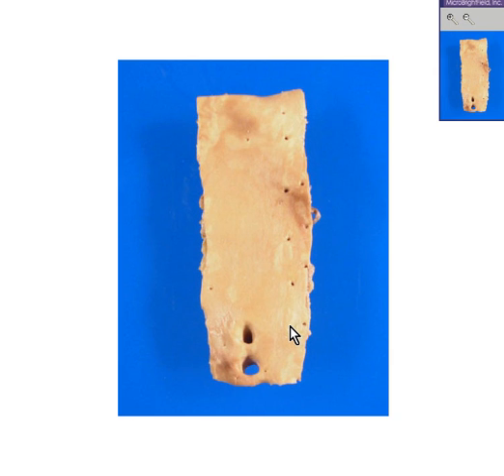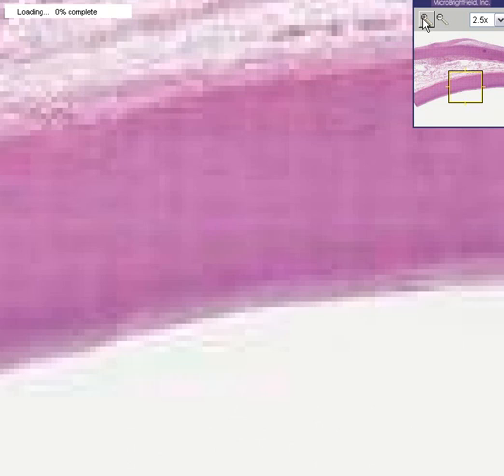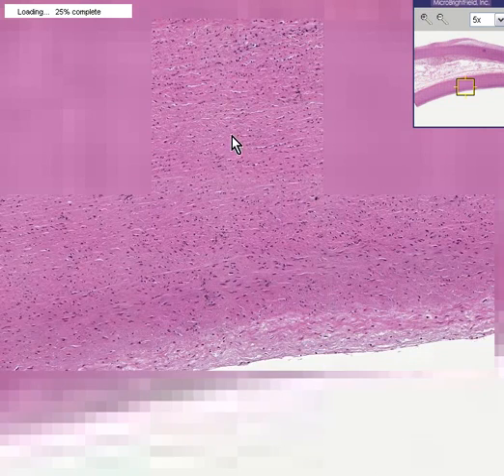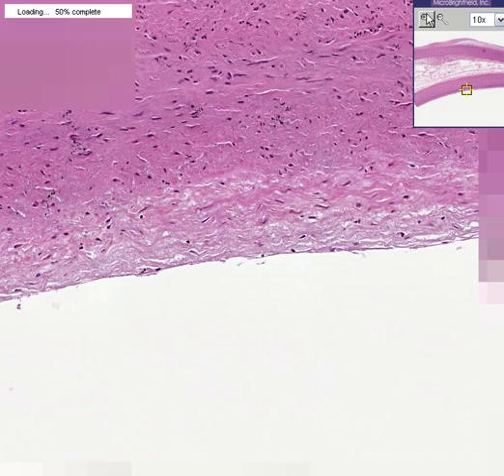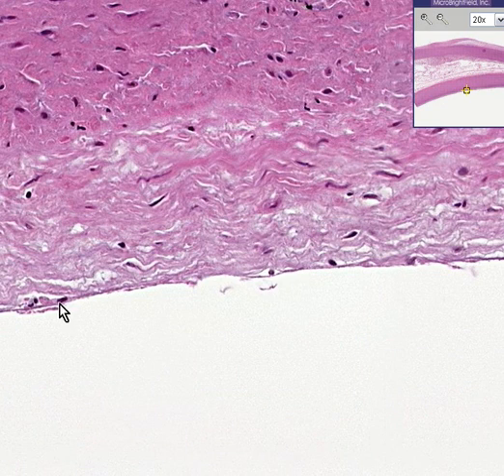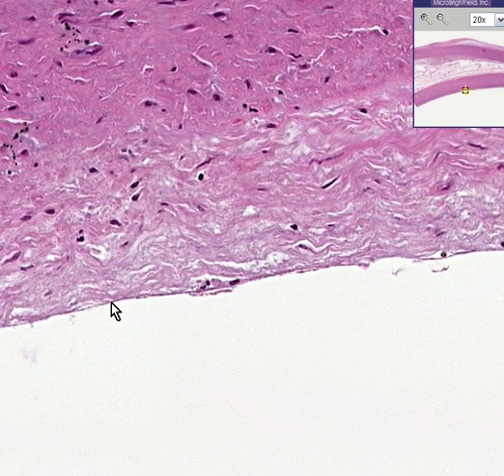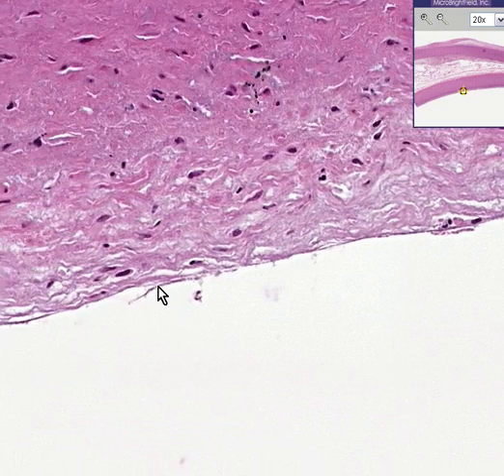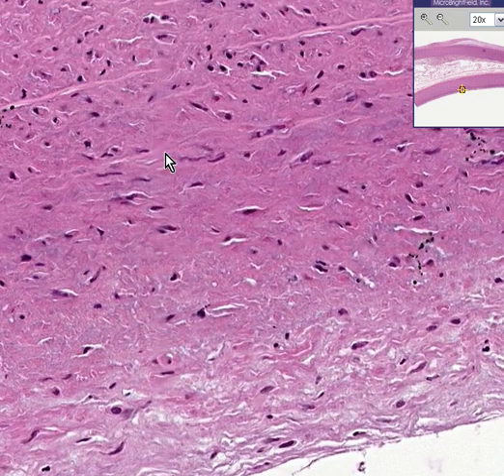We're looking at that same aorta now, only microscopically. Even though this is the very largest blood vessel of your body, the intimal or luminal surface is basically the same as any capillary — it is lined by a single endothelial cell. You can see the nucleus of an endothelial cell here, and this is a fairly normal wall of the aorta.